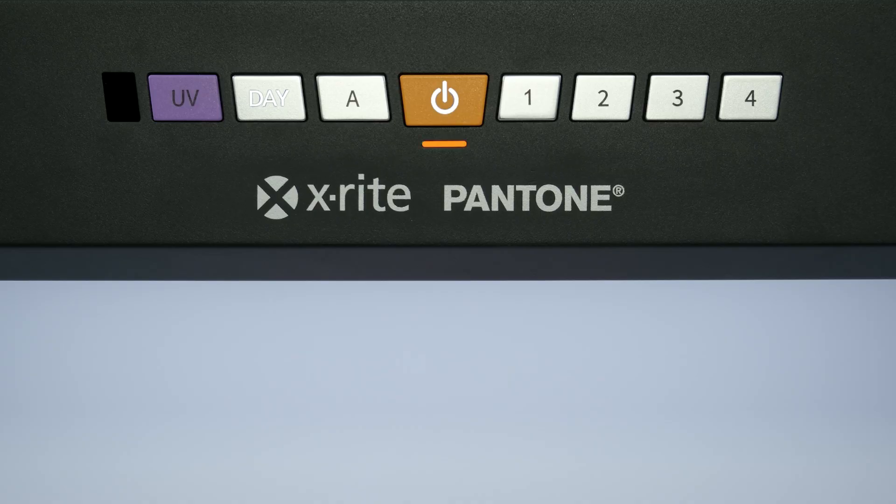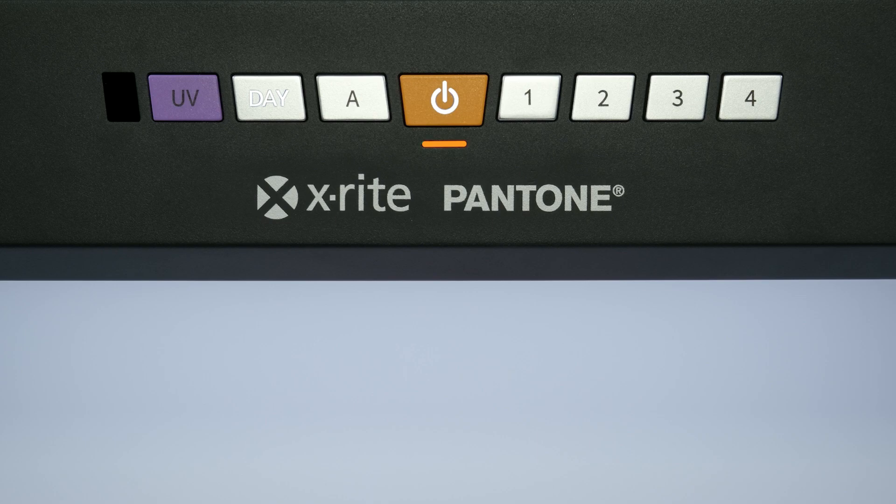If the LED is orange, your certification is expired and you should contact X-Rite service.